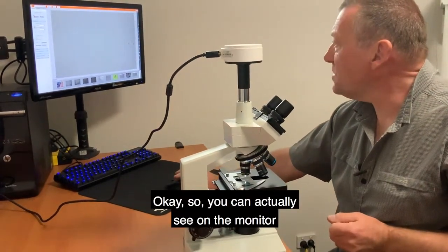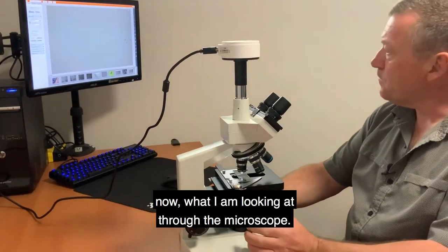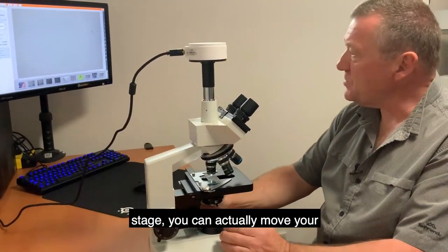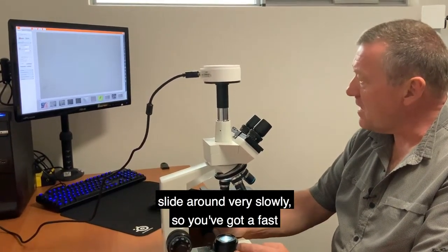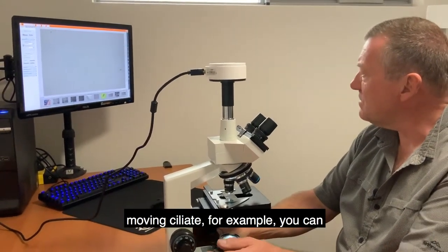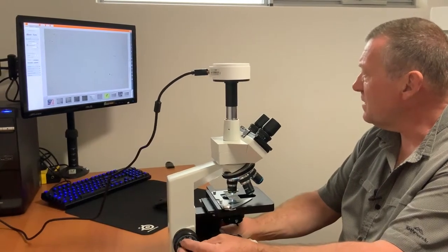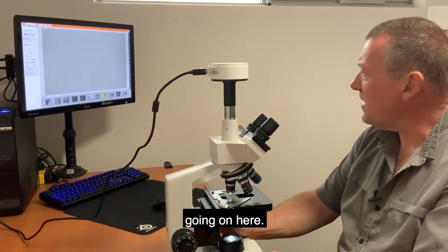You can now see on the monitor what I'm looking at through the microscope. As I mentioned earlier with the movable stage, you can move your slide around very slowly — so if you have a fast-moving ciliate, for example, you can follow it around the screen. You can see a bit of microbe activity going on here.